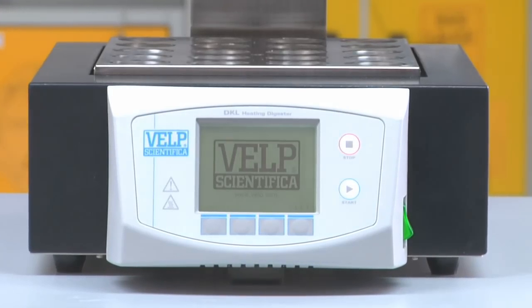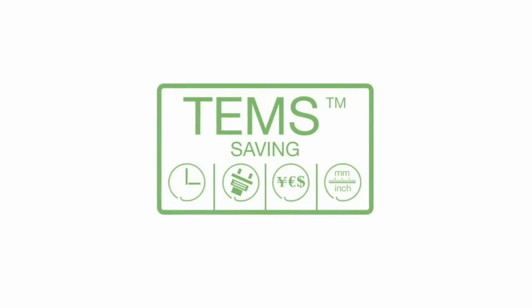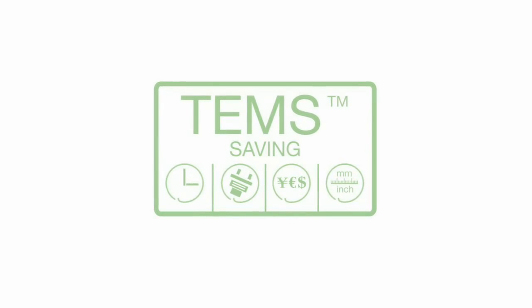The DKL Series incorporates the exclusive TEMS technology for conspicuous savings in terms of time, energy, money and space.